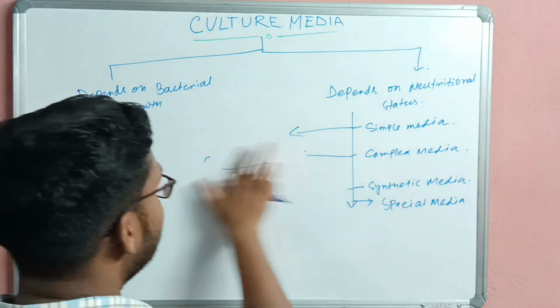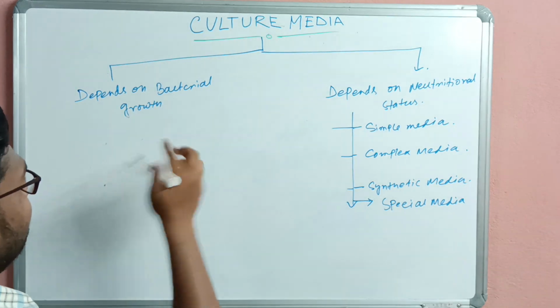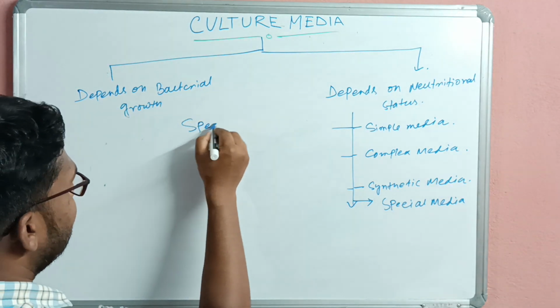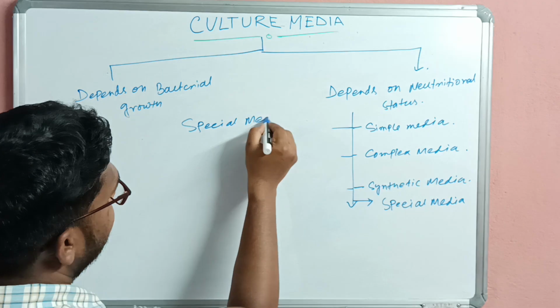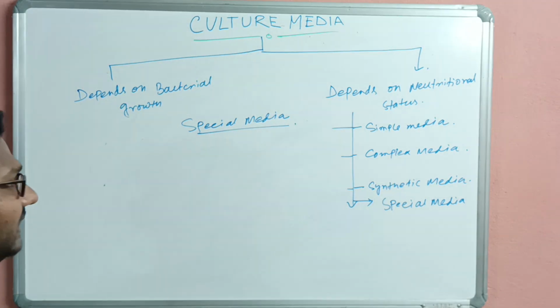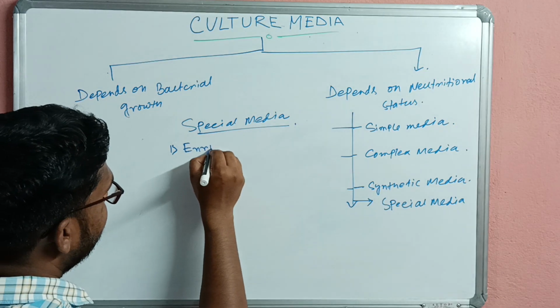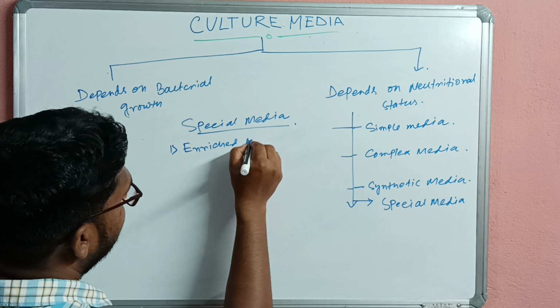Now special media. It is very important. What types of special media are present? One is the enriched media.